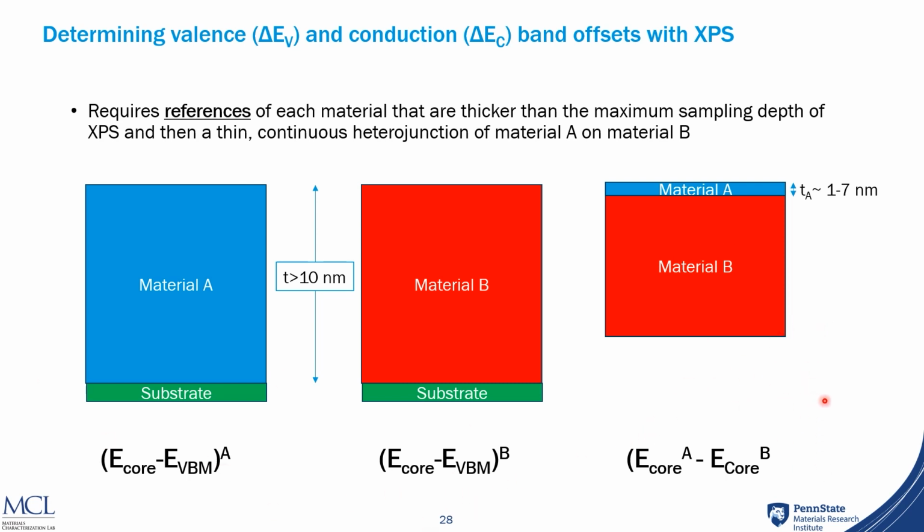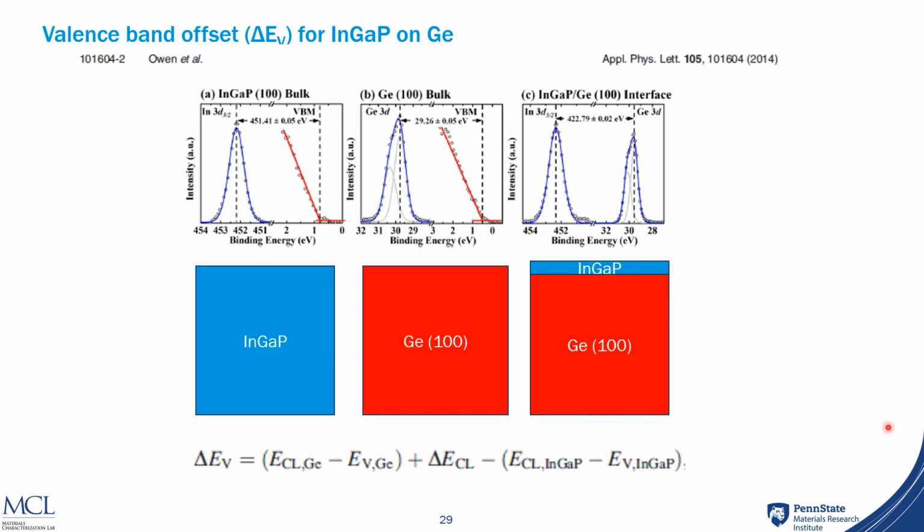And then it's a relatively simple mathematical formula where we can measure the valence band and conduction band offsets. I think we also need the band gap to get the conduction band offsets, but we can measure these positions. And this is a good way to predict the properties of a junction of a material.